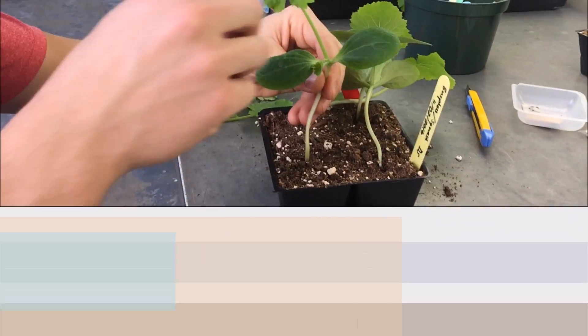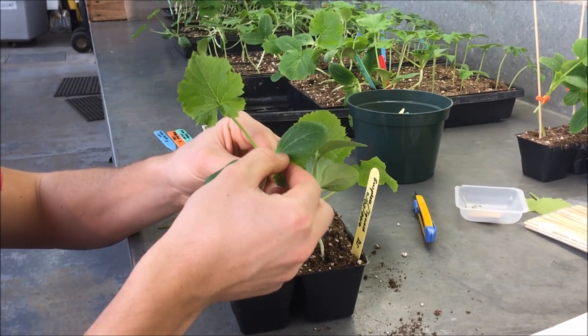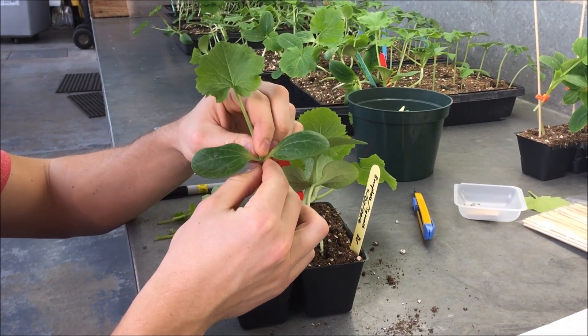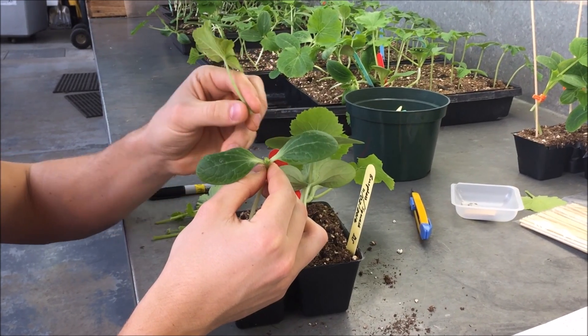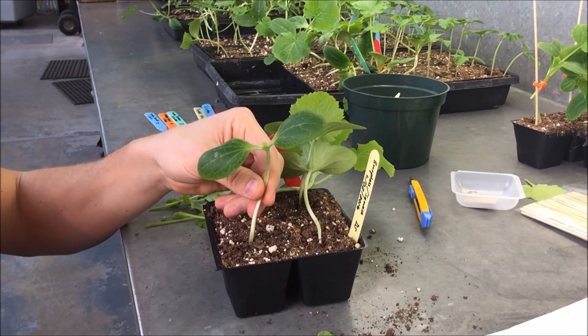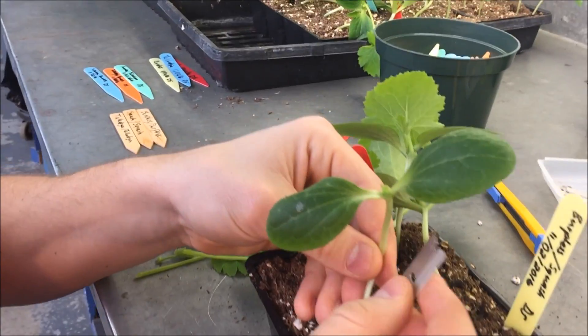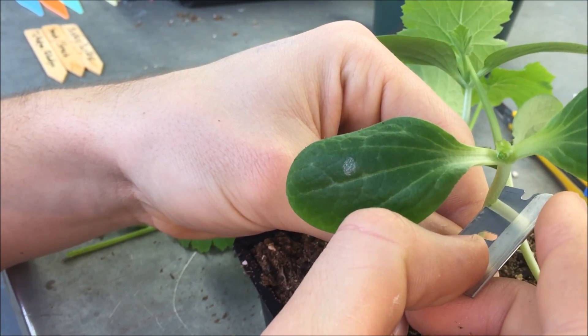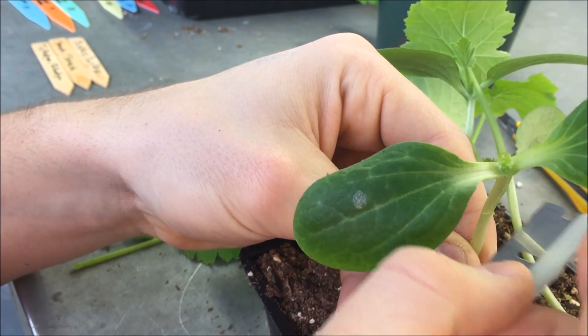First of all, the two leaves are removed from the LP squash rootstock. Only the cotyledons are left on the plant. Then a slanting cut is done downward in the rootstock stem at about 2 cm below the cotyledons. Be careful not to cut the stem entirely.